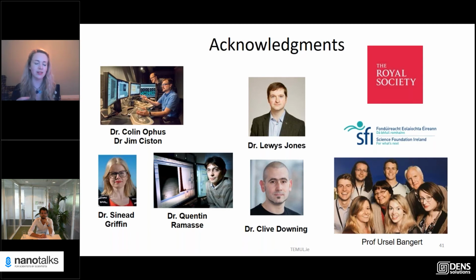I hope also to start getting more creative with in-situ biasing, so putting down my contacts in different ways, like, let's say, 4-point probe measurements as well, because I can start seeing now that you don't need to just study, let's say, the movement of a single domain wall. Also, you can form these fourfold junctions and all these kinds of exotic types of junctions that some people are suggesting for other ferroelectric and ferromagnetic materials, that could be these kinds of quantum dot states, or for really exotic devices, really long term as well.